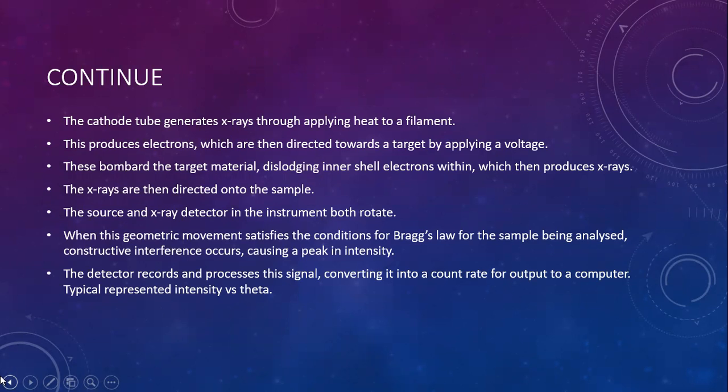This produces electrons which are then accelerated towards a target by applying a voltage. These bombard the target material, dislodging inner shell electrons, which then produce X-rays.